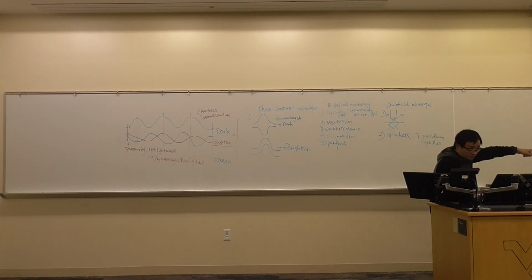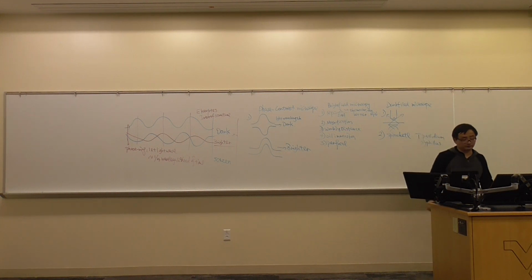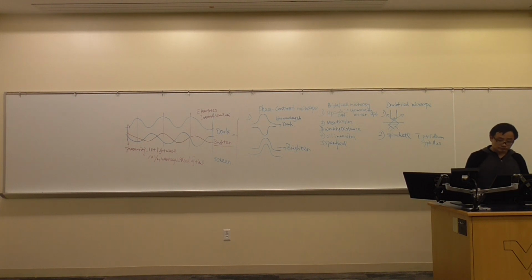Obviously, you like the middle one, because it's shining, it's bright, and you can see the internal structure there. This is the one that's just an art picture, and this is the one that's too shiny. You see the inside is white, but you can see the internal structure more clearly using a phase contrast microscope. So that's the function of the phase contrast microscope.